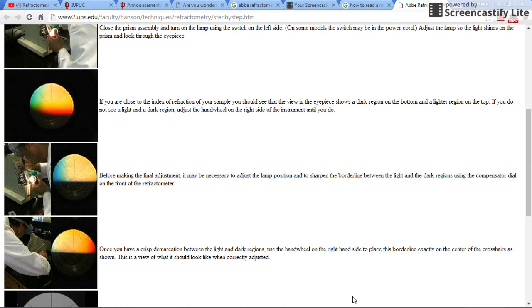We're going to triple up in this lab. The scenario this time is we've been hired by a group to determine the possibility of a compound called thrust, which is supposedly a gasoline additive, can actually be an engine performance additive that really would work.